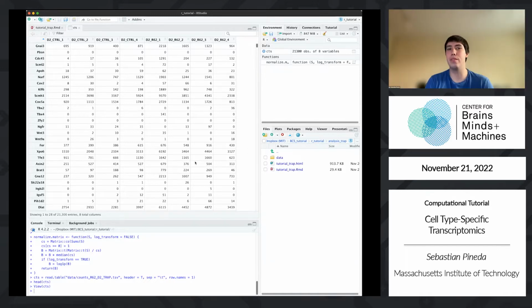There are ways to do it such that you can make sure you only sequence or align each transcript once. And if you do that, that's what you do in single cell, you lose the splicing information. You don't have to do it here. But if you sequence the whole thing, then you don't know if this fragment from exon 1 and this other fragment from exon 8 came from the same transcript. And if one gene is 10 times longer than another gene, then you have to scale that gene by 10.